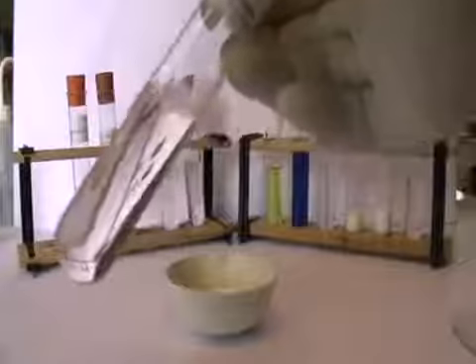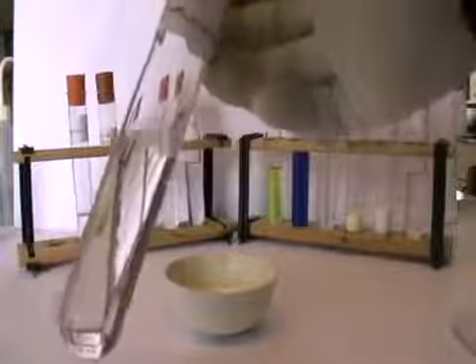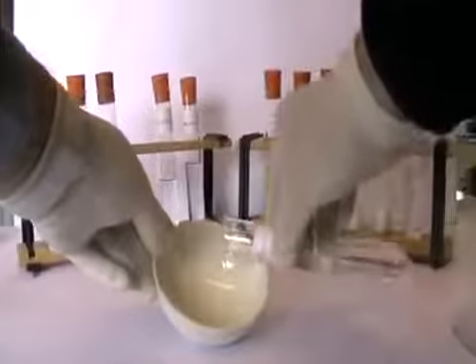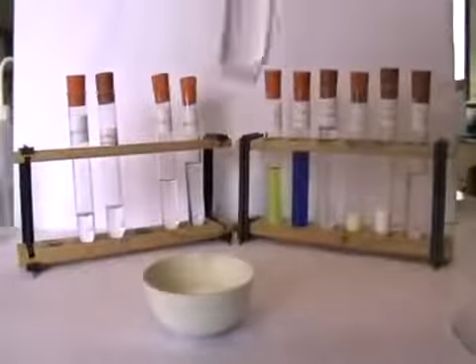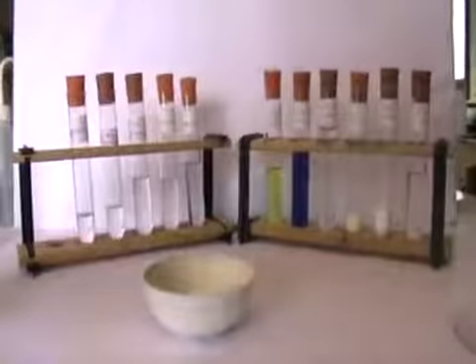I would go for one of the following two: a fruity smell or the smell of fruit drops. Pour a little bit of this then into the evaporating basin, just a few cubic centimetres. Put the stopper on, and let's see if this will burn in air.